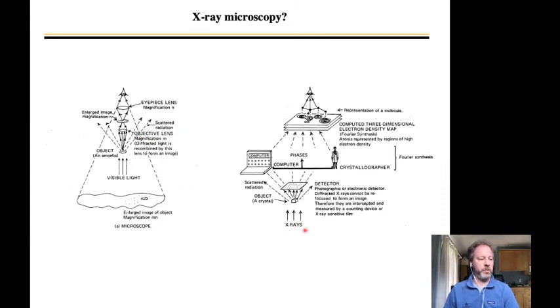So X-rays come in from the bottom, hit our crystal. The X-rays are diffracted by constructive and destructive interference patterns. We detect those constructive patterns as spots on a detector, and then we use a computer. This looks like a laptop, but maybe not. Anyway, hopefully you're using a fancier computer than this, and a crystallographer, presumably to scale with this computer. And you assemble the data into a structure which then goes into your eye. This is silly, but make sure to look directly at the structure.